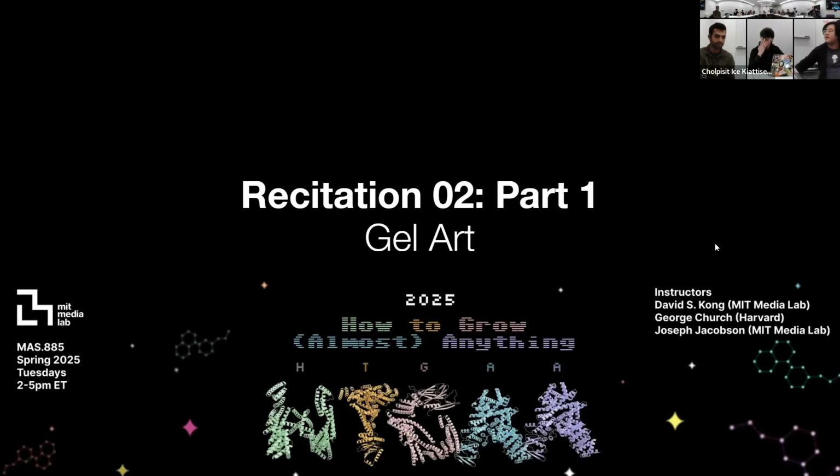Okay, so welcome everyone to today's week 2 recitation. If you attended the class yesterday, you saw that we worked a lot on DNA write, edit, and read. So today we're going to focus on the DNA work, and it's going to be related to the lab that we're doing tomorrow for the MIT people here. For those who are doing the accessible lab or trying to set up things, I know this will be relevant as well, you can get into the gel running workshop.